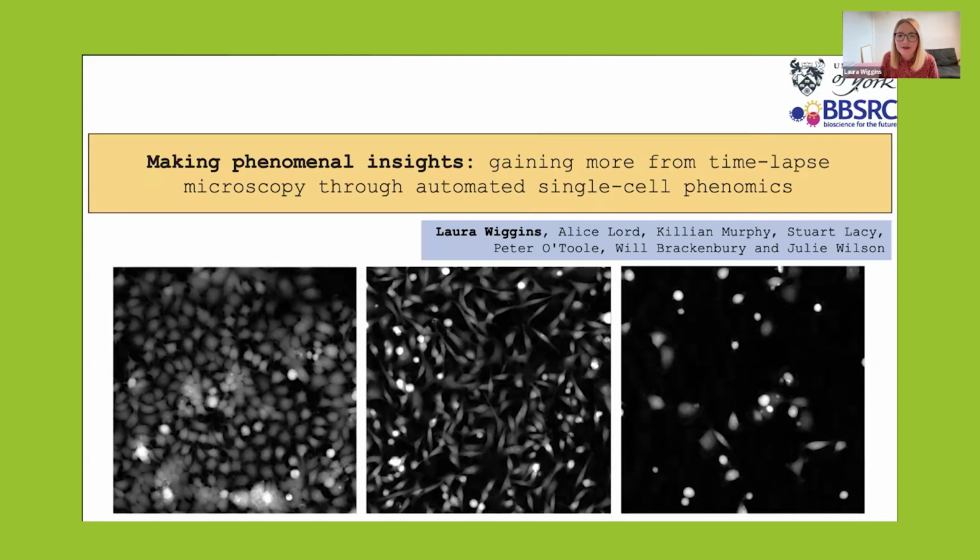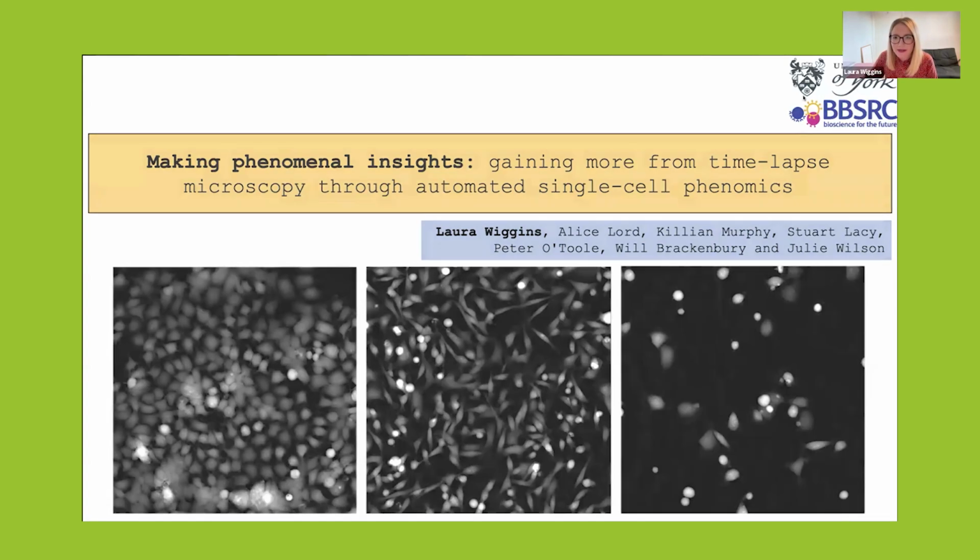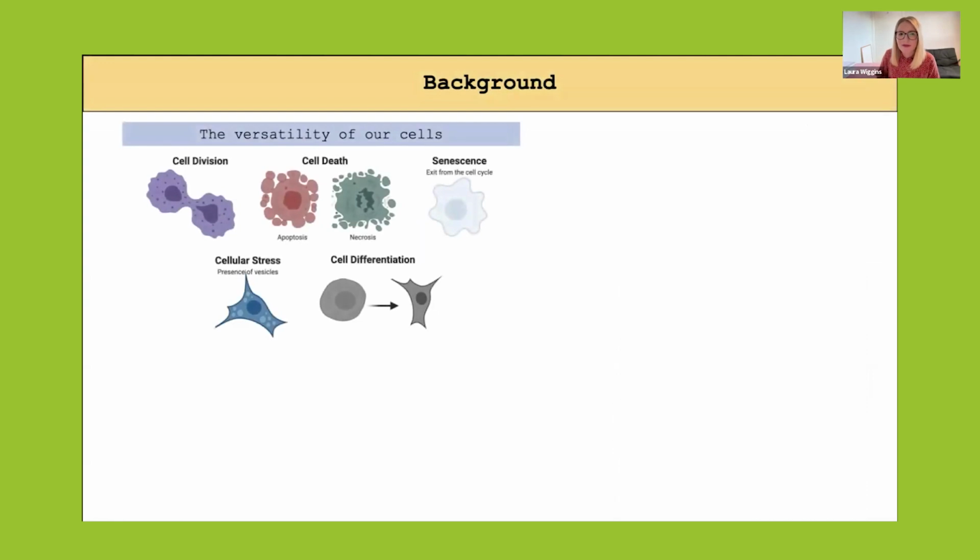What I wanted to talk about today is how you can make phenomenal insights using your single cell phenomics data. So I couldn't miss out on the opportunity to include a pun there. But what I'd like to do is raise awareness of time-lapse microscopy and its advantages over static time point microscopy, and also to discuss our analysis toolkit for time-lapse imaging, which is called Selfy. So I will begin with a little bit of background to the project.